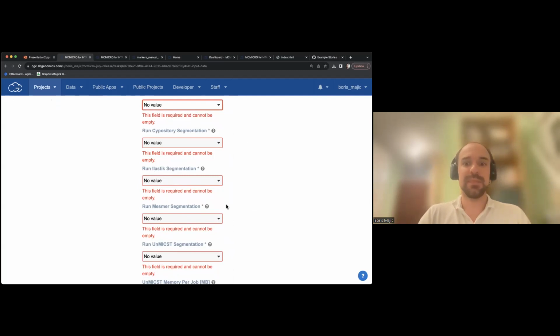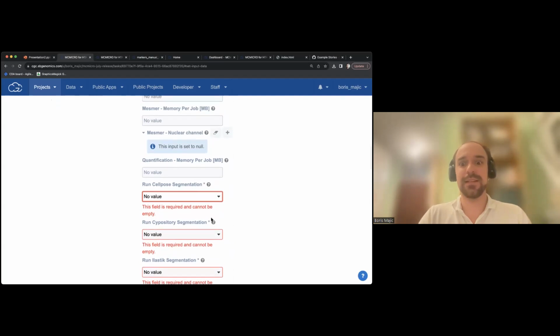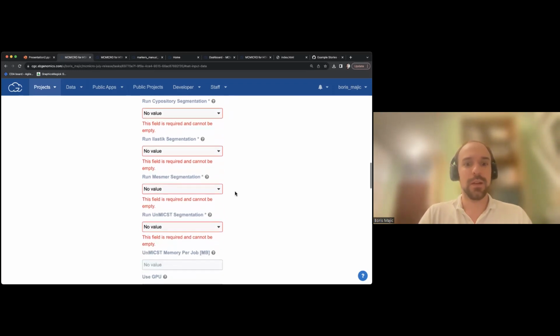Some of these are sometimes more problematic than the rest, and you should make sure that your image is the proper size, as you described in the beginning, because if your cells are too small or too large, segmentation algorithms won't detect any cells, and then the workflow can fail, because for the downstream analysis, it is necessary to have at least 20 or 30 cells in your image to be able to perform a cluster analysis, for example.